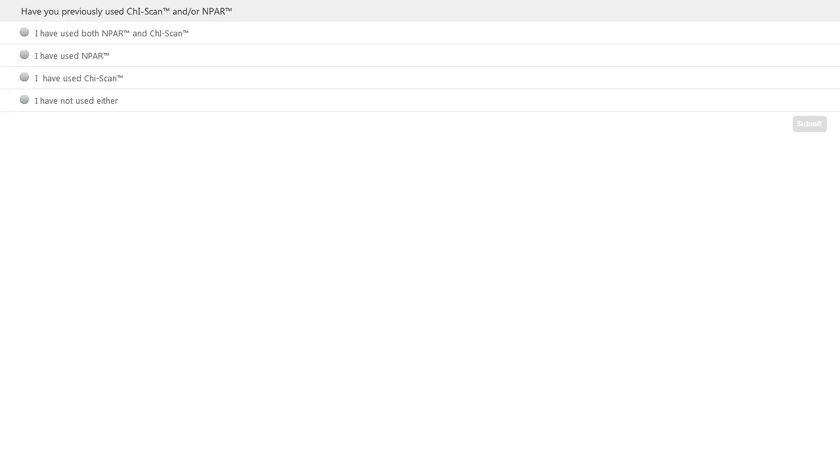So now it's going to be everybody's favorite time. It's poll time. Here I just want to know if you've previously used ChI-Scan and/or NPAR. We just want to know if you're using these tools that are available to you. NPAR is a paid add-on, so I know everybody doesn't have that, but ChI-Scan is something everybody has. These two tools combined really give you more and more power, more options for dealing with difficult data sets.